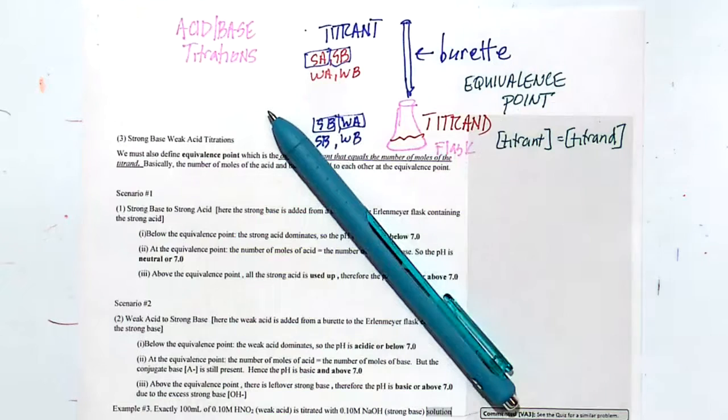All right, let's do a titration here. Larissa set this up for me. Okay, so let's see if I'll do it here. So here's my titrand. This is just water. Okay, so I'm going to add some vinegar to this. Okay, so you guys can relax a little bit. So vinegar, another name for vinegar is acetic acid. So let's add about 5 mLs of this vinegar. So essentially acetic acid.